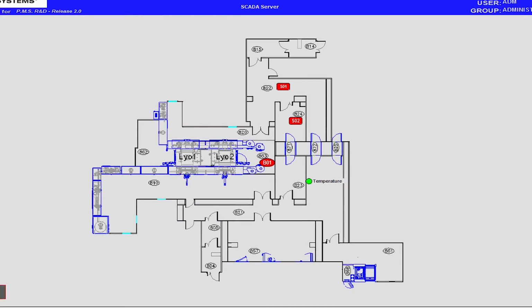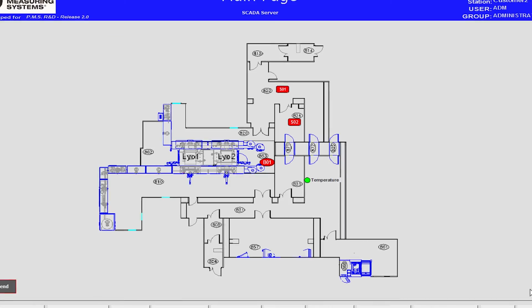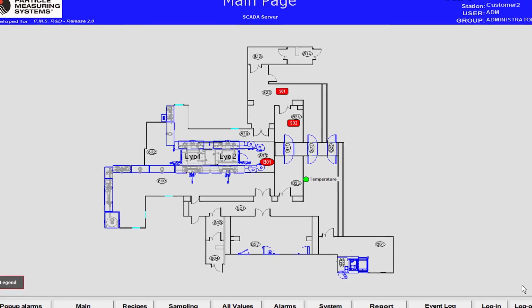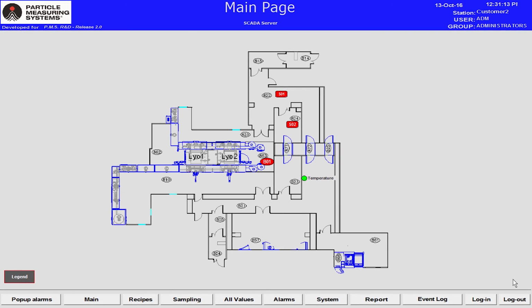The user interface is a critical part of any SCADA-based system, allowing for the easy collection of data as well as providing reports that provide valuable data for proper operation of a controlled environment for the manufacturing of products.